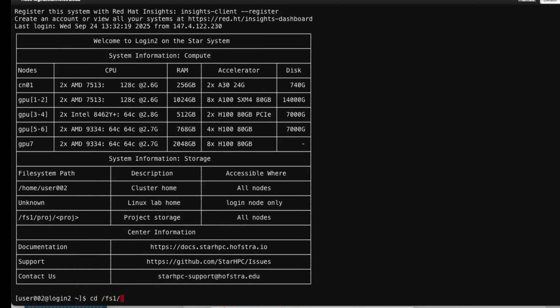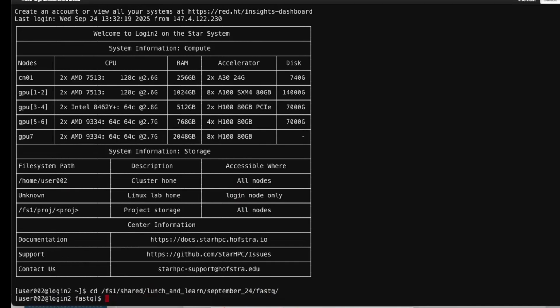You guys must be really annoyed, because I bet you're doing the same thing over and over again if you're actually following along. I'm very sorry. Keep typing ls, skip the... Oh, that's a good idea. A little ls every once in a while. Yes, that is very smart. Okay, I will start doing that. Yes, that is a good point.